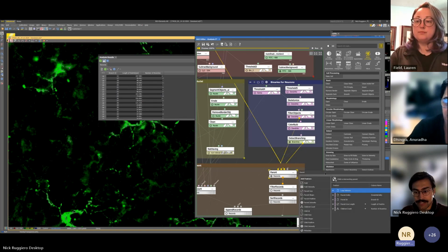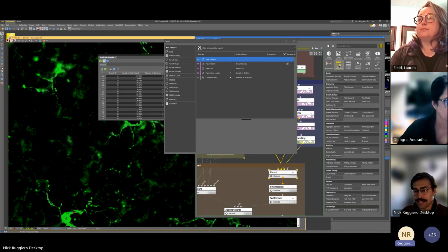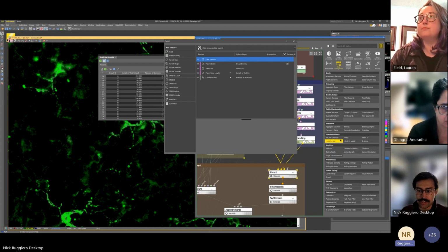Again, if we double click on this, pretty much all of our measurements, and at this point, I've moved on to the data management section. Most of the stuff is going to live in this measurement tab and data management tab. As you can see, there's a ton of stuff in here. This is probably a good place to start accessing the help menu, especially when we're looking at accumulating records, aggregating rows. It's just how we're going to organize our data into more easily digestible tables. And we can also do some of our statistical tests down here.